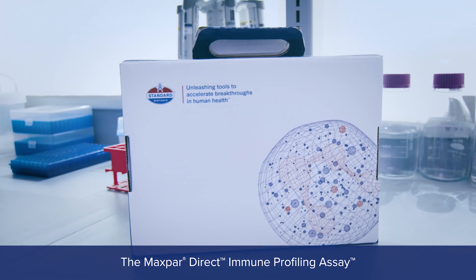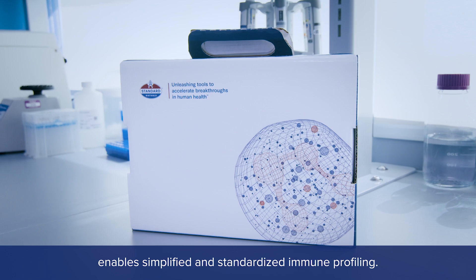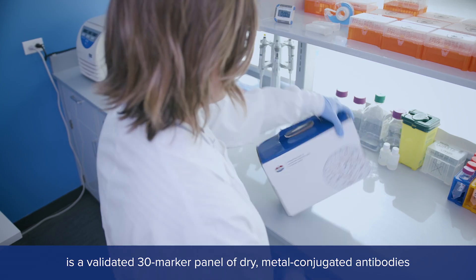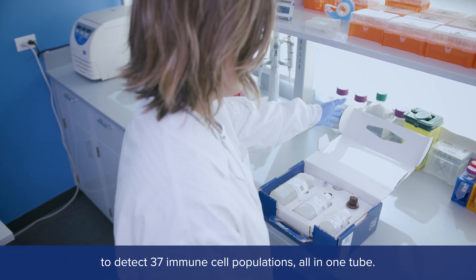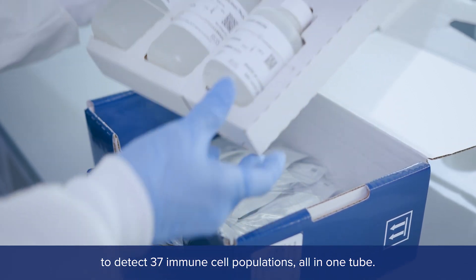the Maxpar Direct Immune Profiling Assay enables simplified and standardized immune profiling. The Maxpar Direct Immune Profiling Assay is a validated 30-marker panel of dry, metal-conjugated antibodies to detect 37 immune cell populations, all in one tube.